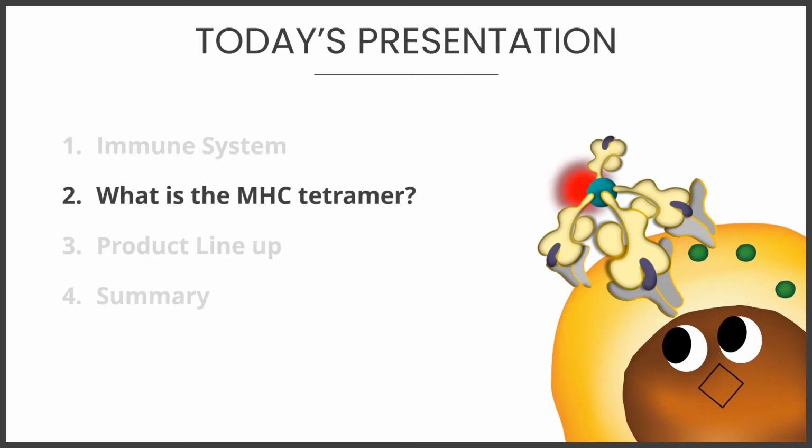Given these considerations, we changed the strategy we were using to capture target T cells and acquired MHC Tetramer technology. In the following slides, I will explain MHC Tetramer and its application in this type of study.